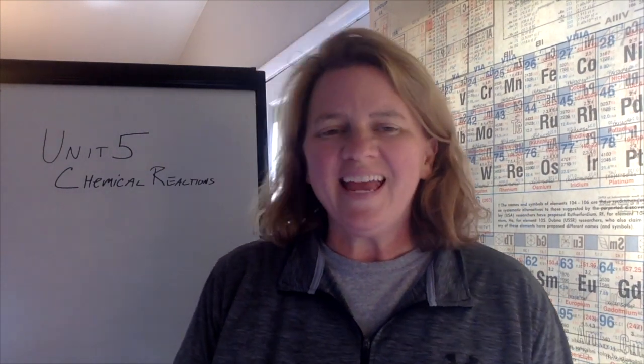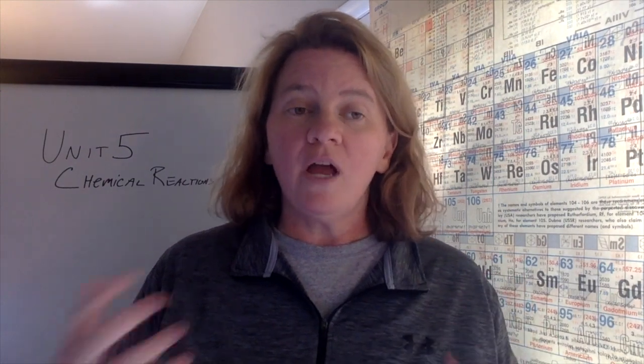Hi everybody and welcome to our chemical change lab. In today's lab, you are going to be watching Maurice go through several different chemical reactions.